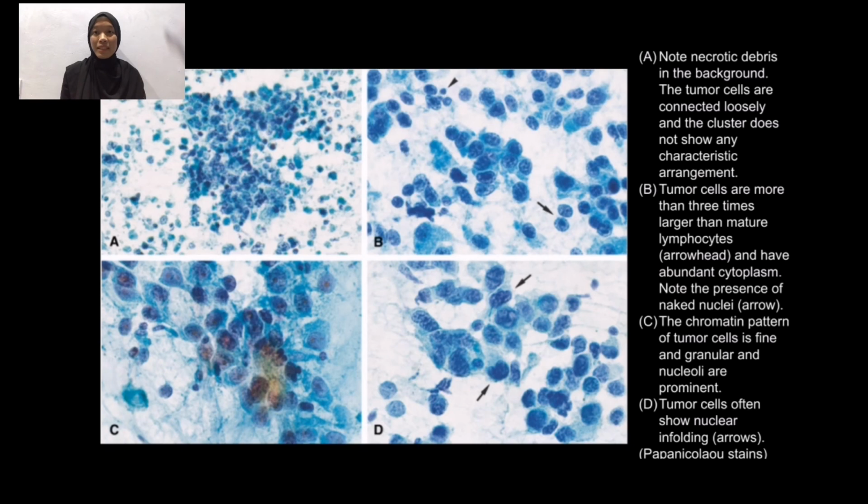For these pictures, let's see one by one. A. We must note the necrotic debris in the background. The tumor cells are connected loosely and the cluster does not show any characteristic arrangement.